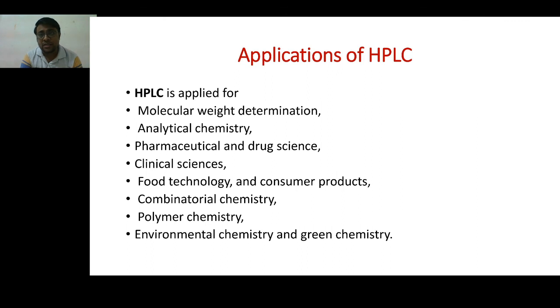Now let us see the applications of HPLC. HPLC means high performance or high pressure liquid chromatography. It is used in molecular weight determination, analytical chemistry, pharmaceutical industries, the study of drugs, clinical trials, food technology, combinatorial chemistry, polymer chemistry, environmental chemistry, and so on. This is the benchmark technique used in pharmaceutical chemistry. I'm going to stop here.